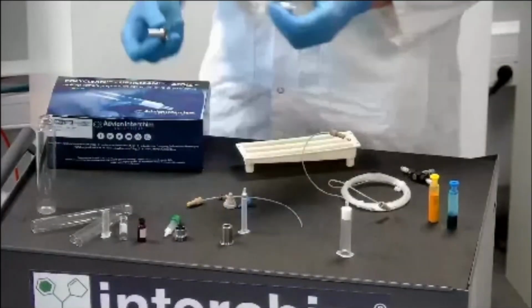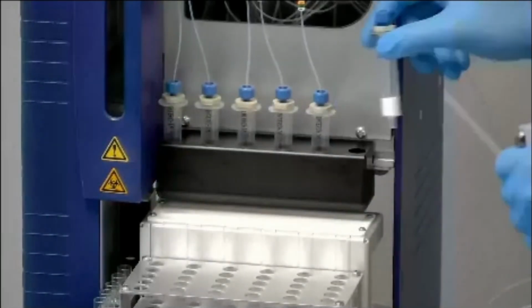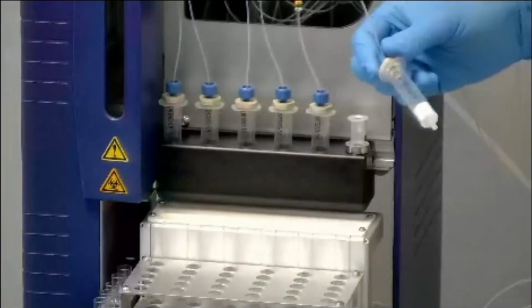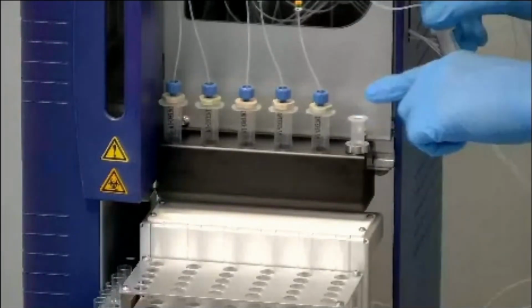I take my adapters and I can change, for example, this position and convert it to SPE columns 3 ml. And thanks to these adapters, you have the possibility to plug your plunger, your adapters inside your columns.